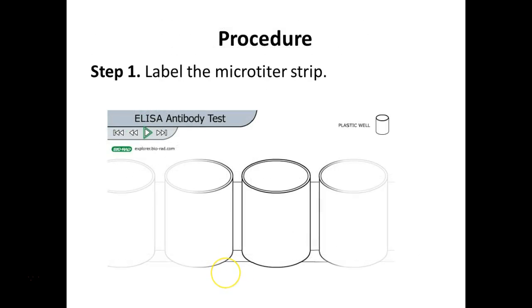And we're going to label them. With your Sharpie marker, you're going to write right on that strip, and you'll see that there's a little white demo in there, right? So you're going to go plus, plus, plus, negative, negative, negative, 3, 3, 4, 4. So inside your bin, there's the example right there. Yeah. So you want to label your strip just like the demo, and you write right on the tube, right on the wells, as it is in the demo.